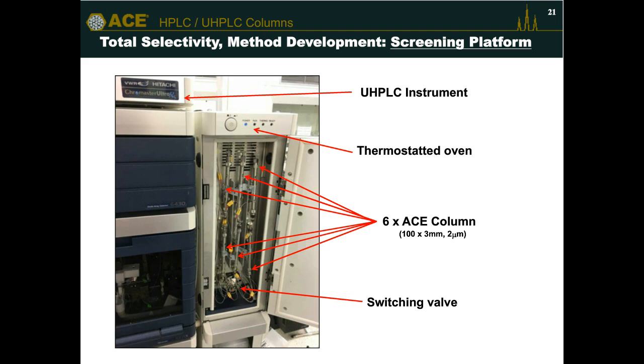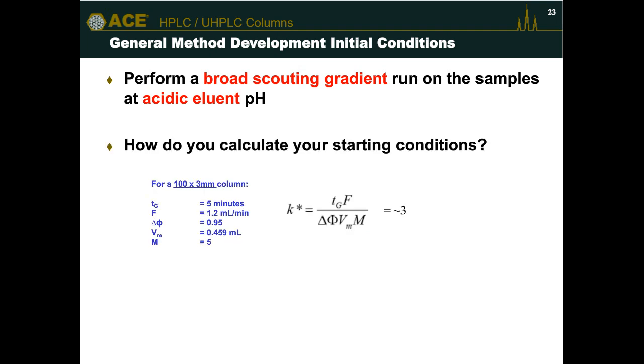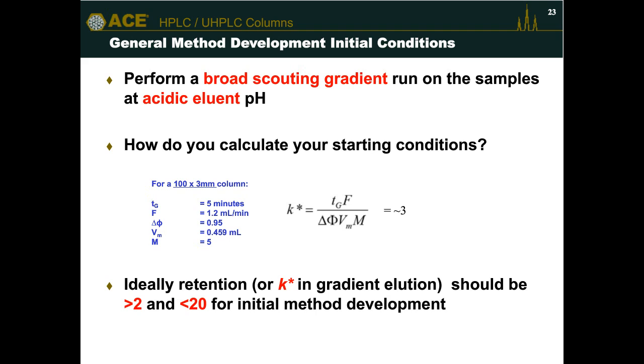Referring back to an answer you provided before, someone asks if you use HPLC equipment with UV and MS as detectors, what would be your recommendation for the scouting gradient method to mimic the profiles presented today? I would have to recalculate it. If you look at the equation that I provided, so if whoever's asked that question wants to download the slides, you can see that all of the conditions I've provided are here.